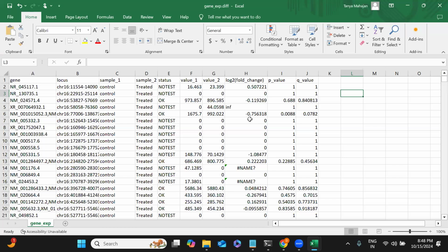Exactly. You got it, Abdullah? Yes, ma'am. Because whenever you want to call the variant, you are going to deal with another application, not this. So here we are dealing with reference-based RNA sequencing. Every time you deal with a reference base, you will get the same data, so there is no difference. Everything is clear in this Excel sheet now? Yes. Okay, now let's see further.